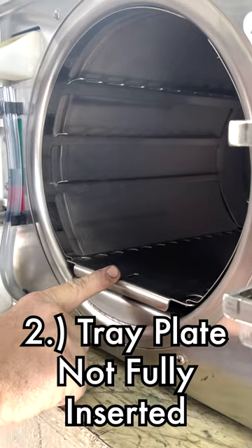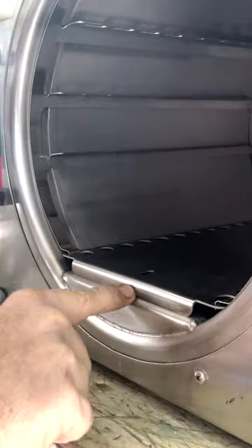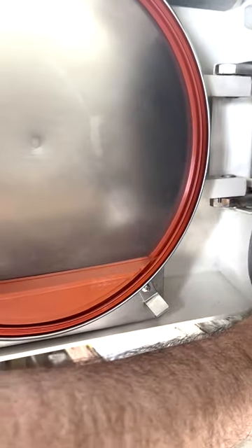And you see how this plate is sticking past there? That's wrong. I'm going to make sure that it's properly set all the way in so it sits in that groove right there. These two need to work together or your machine will overheat.